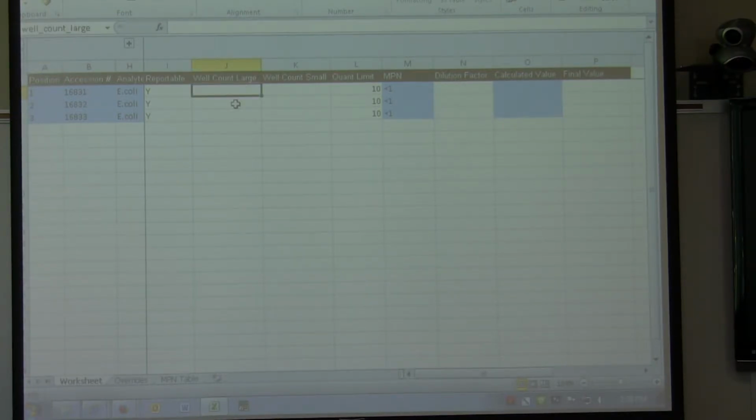Okay. 2020, 11. Do you need dilution factors in on this one? We can put 10, 10, 10.